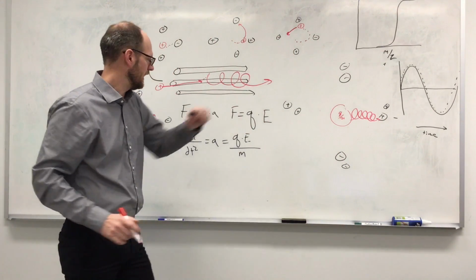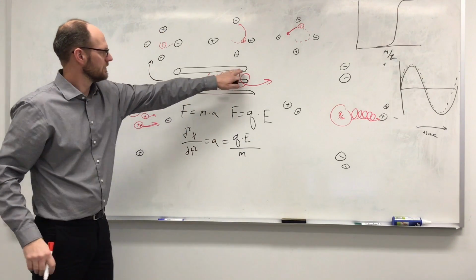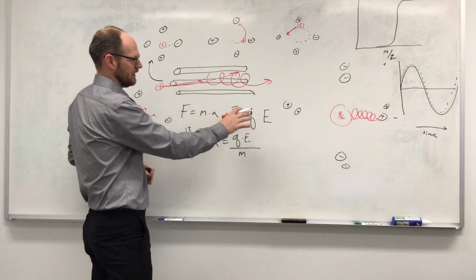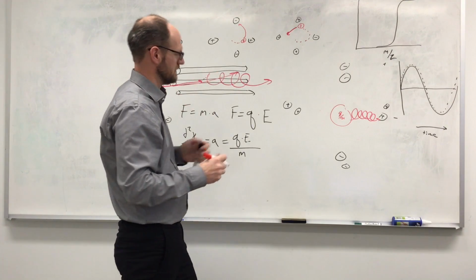It'll bend towards the rod, and eventually large particles that are too big for the electromagnetic field range will destroy themselves on the side of the rod.